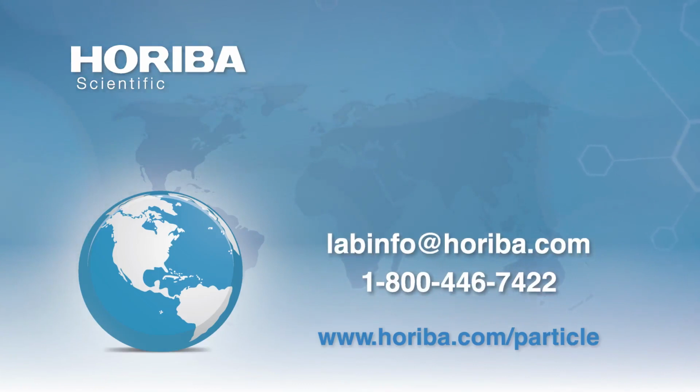So it comes down to two things: what precision do you actually want, and how long do you want to spend? Modern instruments can give you quite a lot of measurements to give you a lot of confidence. But my rule of thumb is, if I get a sample of unknown material, I mix it all up, then I take a sample from the top, the middle, and the bottom, and I make between 3 and 5 measurements on each of them. Perfect. That's generally the rule of thumb we follow as well with laser diffraction and particle size analysis.